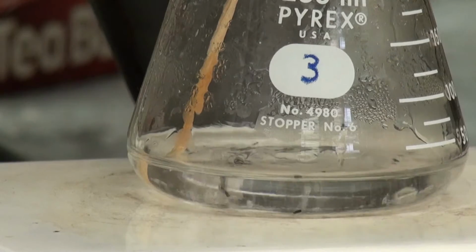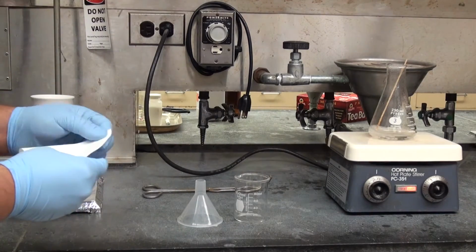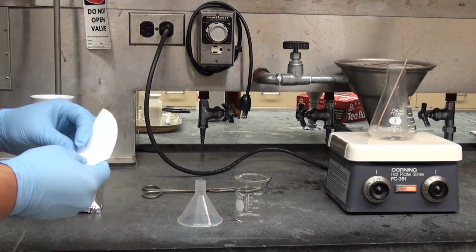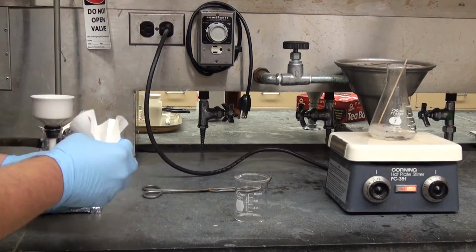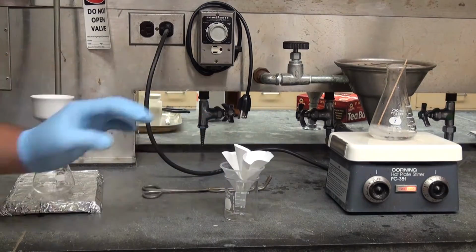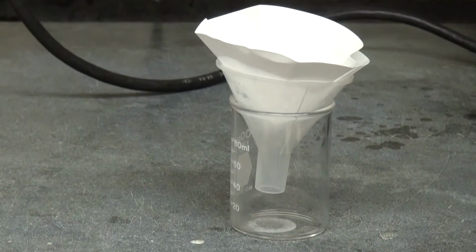Although you are boiling the solution, you do not want to decrease the volume. If necessary, add solvent. Now you can perform a hot gravity filtration to separate the Norit and undissolved impurities from the solution. Use a powder funnel, that is the funnel with the short stem, and fluted filter paper. You can prepare your filter paper yourself.